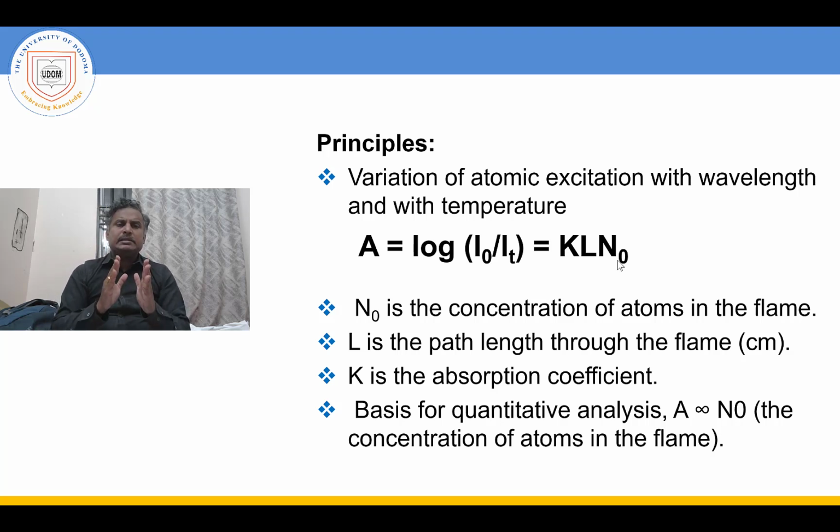So let me summarize. For qualitative analysis, it is the specific wavelengths absorbed or emitted by a given element. That is the basis for qualitative analysis. The absorbance is directly proportional to the concentration of atoms in the flame. That is the basis for quantitative analysis.